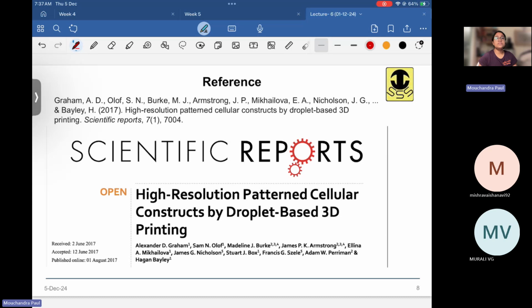But all these bioprinters will use the CAD file, STL file that we discussed in the very beginning. So that thing remains the same. And another thing that remains the same is the tissue type. You can make the same tissue type with different techniques. All right.